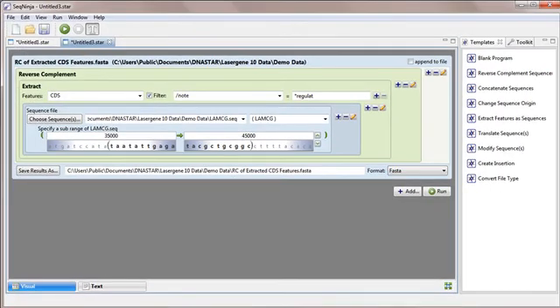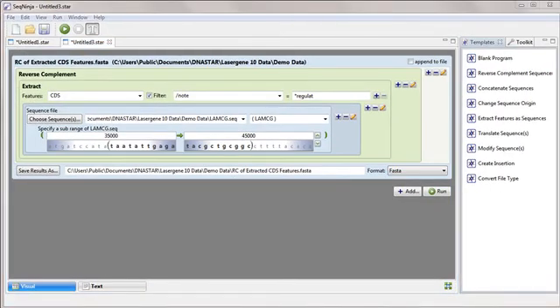Now the program is complete. If desired, we could continue adding templates and toolkit items from the panels at right by using drag and drop or by clicking on them.